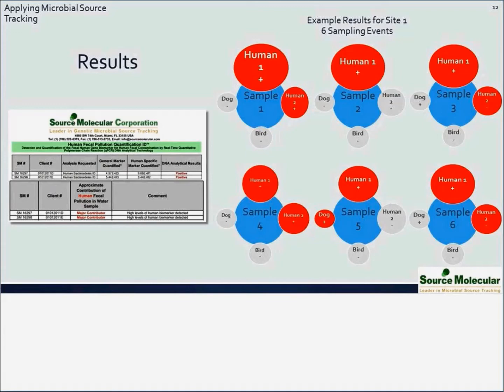So each one of these samples is taken, let's say, from one location over a series of 6 different days. What these bubbles represent: red being a positive result, and negative being represented as gray. The size of the circle represents the signal strength or the quantitative value. And what we see here is that pretty consistently we're finding a lot of reds for human, not a lot of reds for dog and bird.